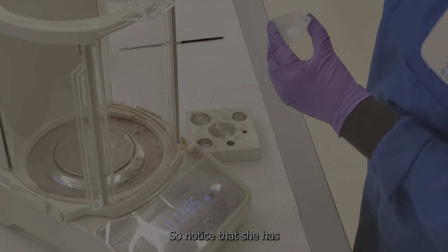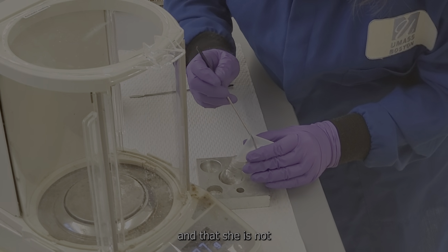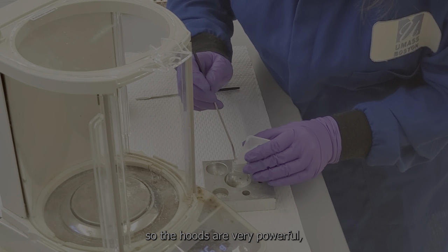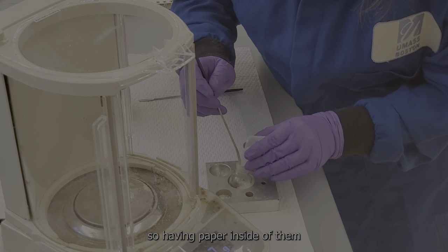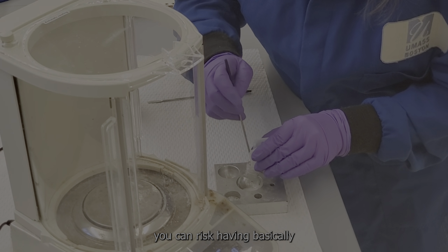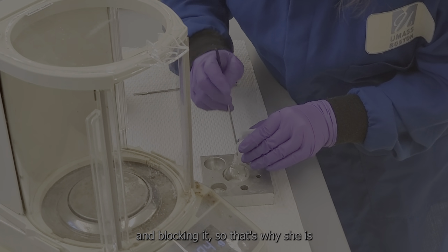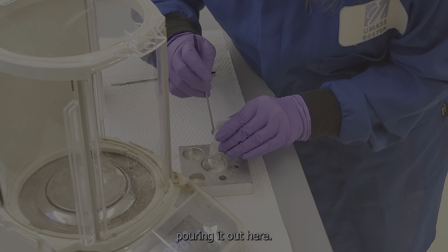Notice that she has the flask in a stand and that she is not doing this in the hood. The hoods are very powerful, so having paper inside of them, you can risk having the weighing boat fly up into the hood and block it. That's why she is pouring it out here.